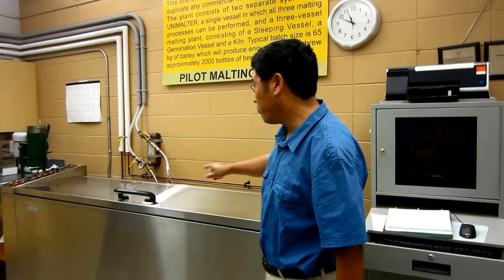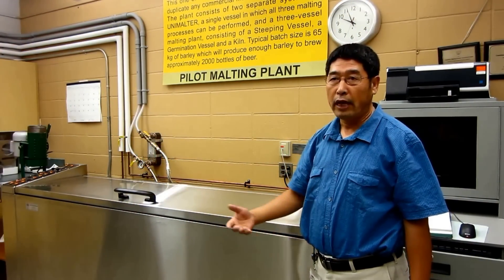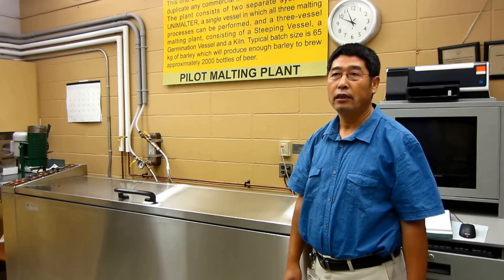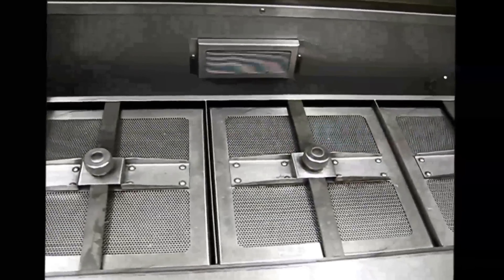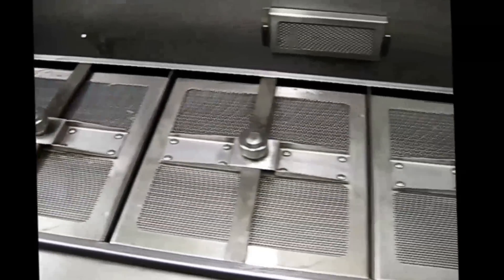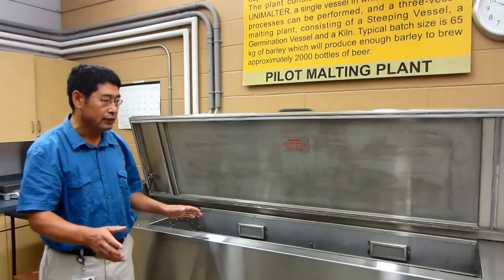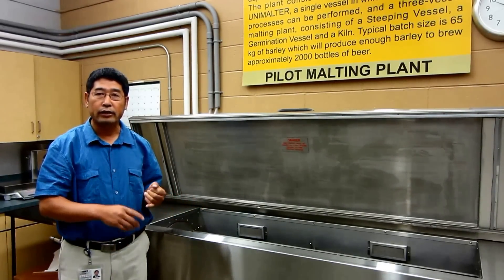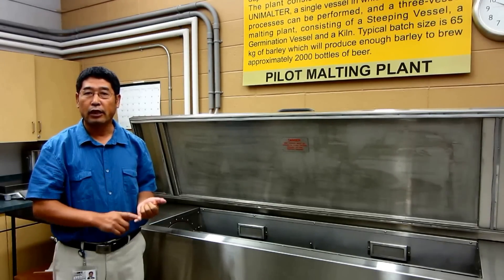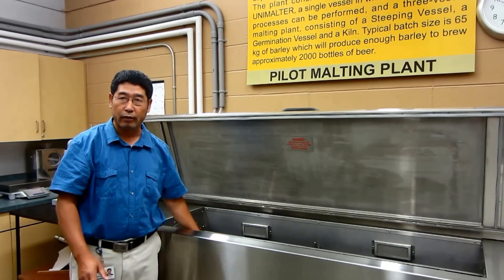Here is our micromalting unit. It can handle anywhere from 10 to 20 samples, depending on the sample size and the testing purpose. This unit is specially designed so that all the major steps for malting — steeping, germination, and kilning — can all be completed within the same unit.